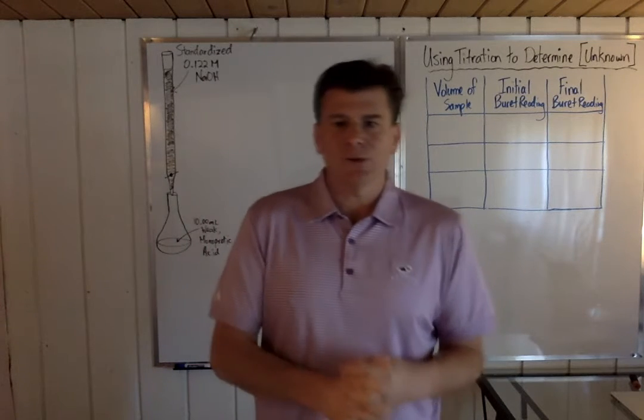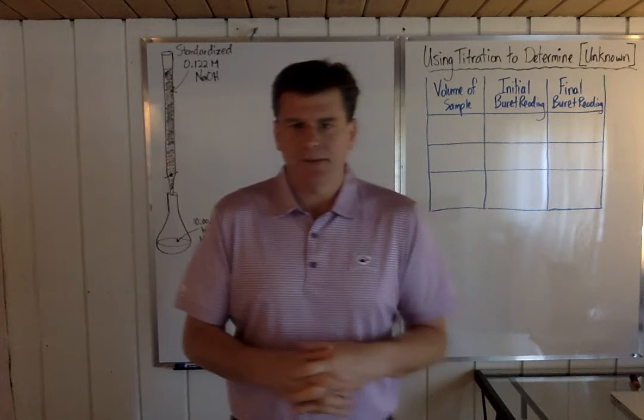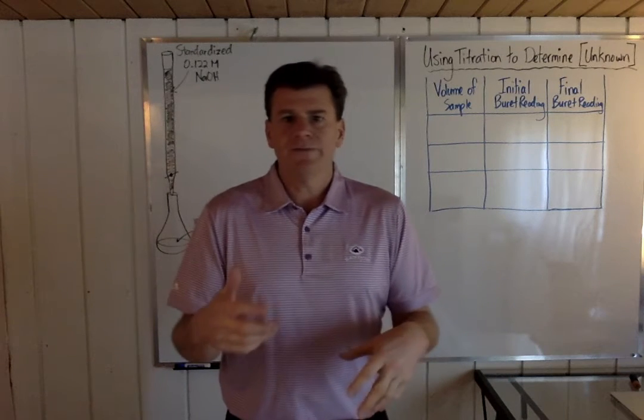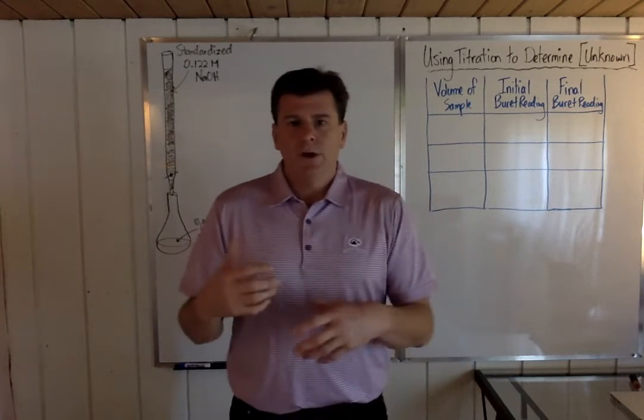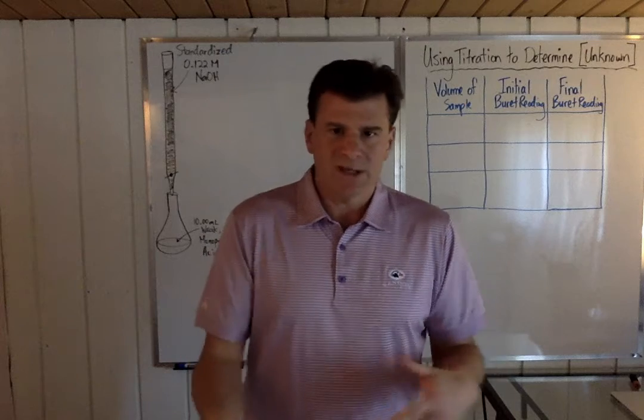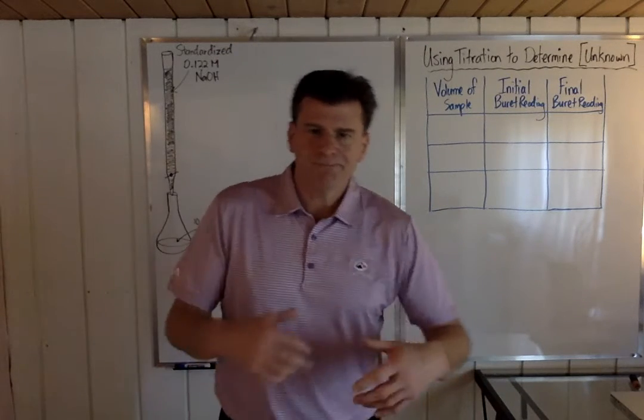What are we on to today? We've been doing titration, talking a lot about the qualitative side of titration so far. What is it? What's the equipment? How do you use the equipment? Just in a general sense.